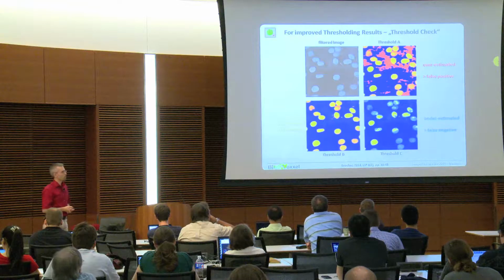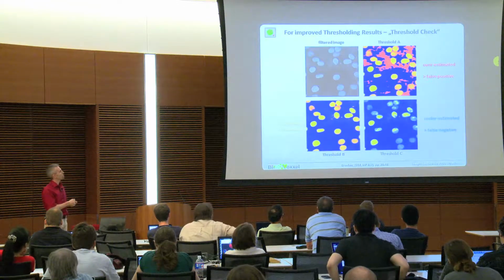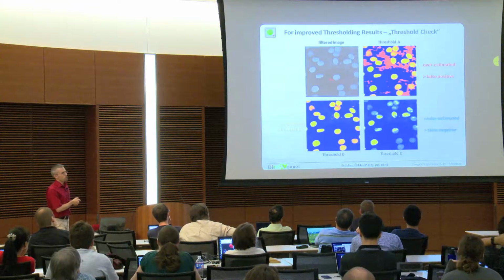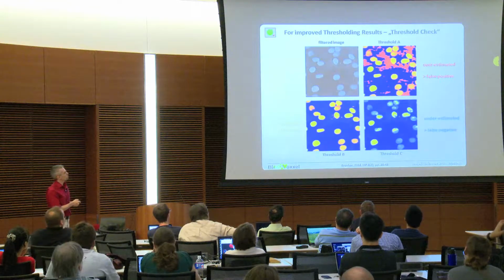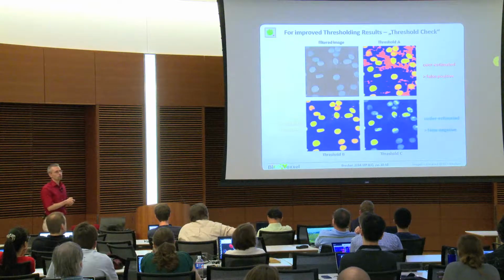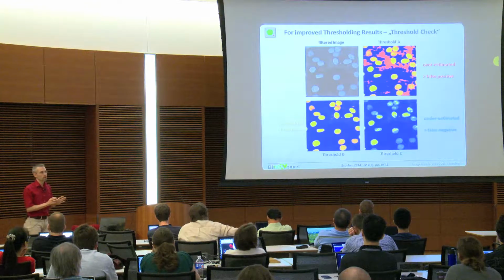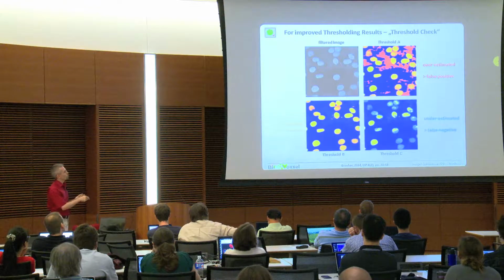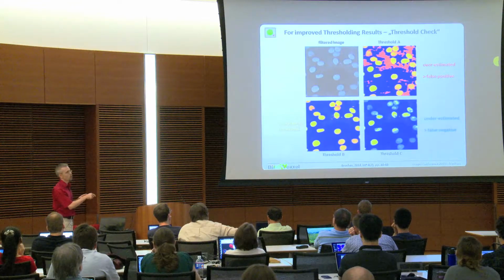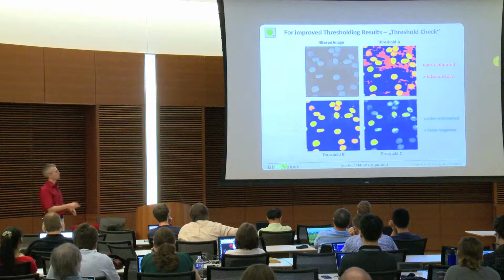So how is this color coding? How can you interpret this color coding? Your features of interest, you see that here after filtering, more homogeneous, are shown in yellow, and if in areas where they are not so bright, in orange. That is basically what we want to have, what we are interested in. If you see red area, that means these are false positive pixels because they are overestimated, so the threshold would extract it, but you don't want to have it.